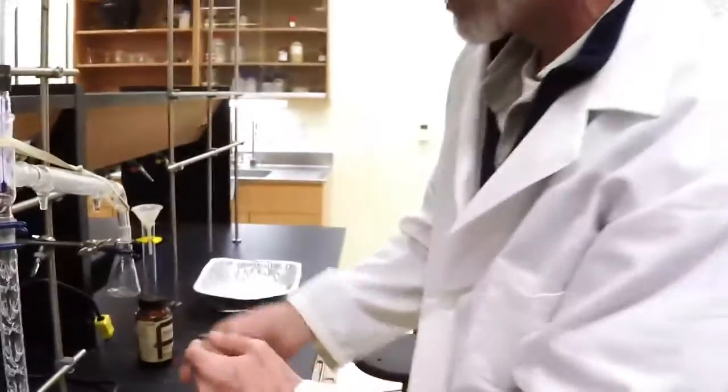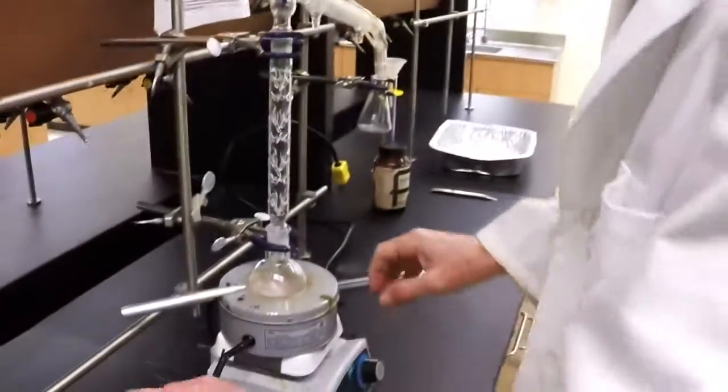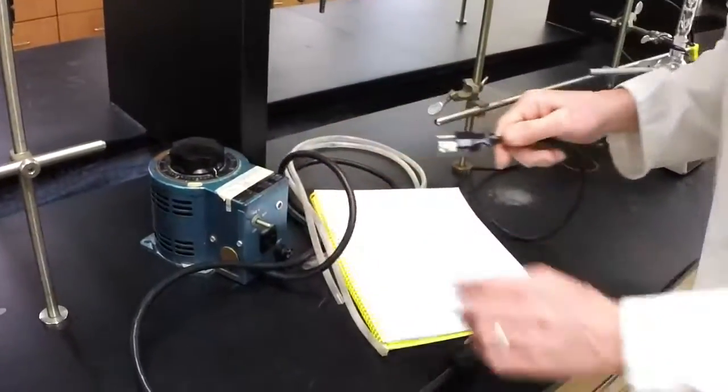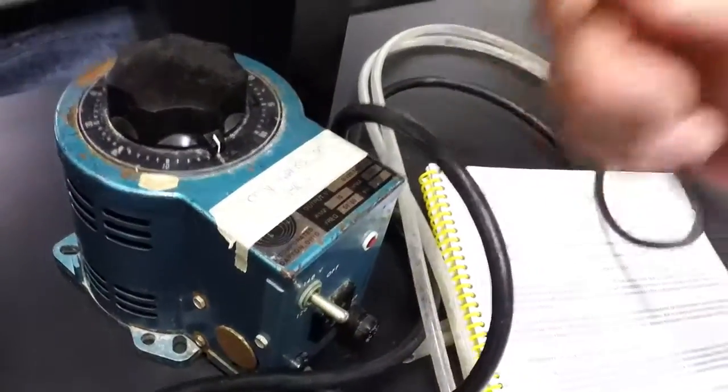Excellent — there's your setup. Water in the bottom, out the top. The heating mantle is always plugged in to the power supply. The power supply is important for the heating.